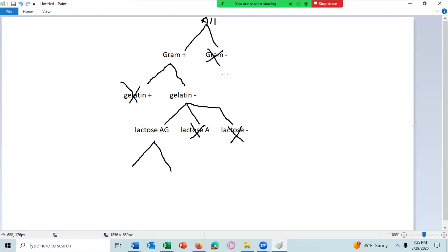And you will be doing the gelatin hydrolysis first, and then the gram stain, and then the lactose test. So in a way, you are doing even the first three that I'm setting up. You're going to be using dichotomous logic on the first three. It's just I'm going to send you all the results at one time, and I really should send them in three different emails, but that would increase my emails to you guys to three, and I don't want to do that.